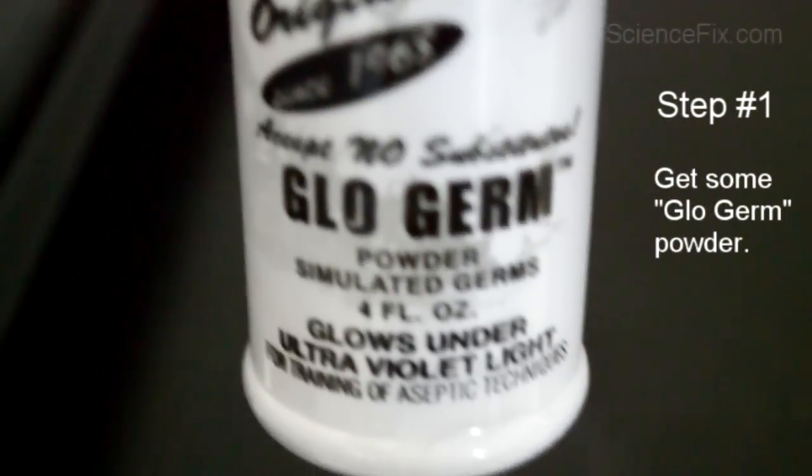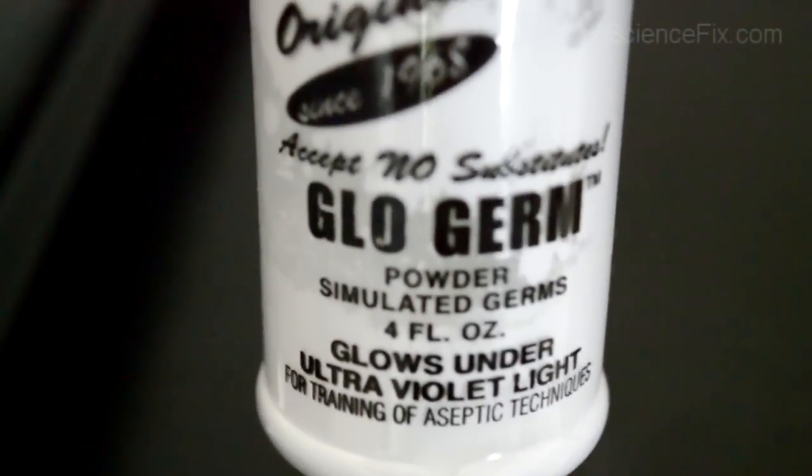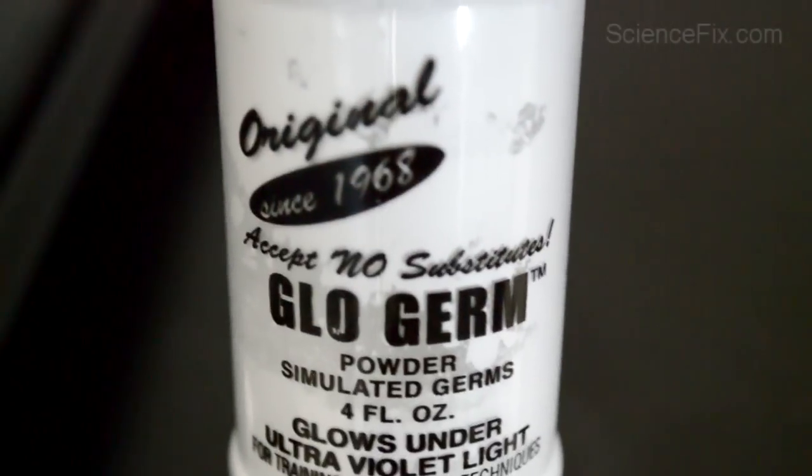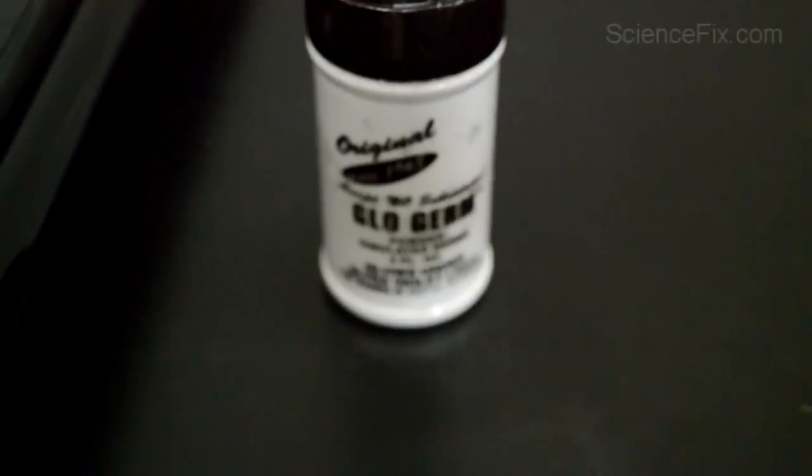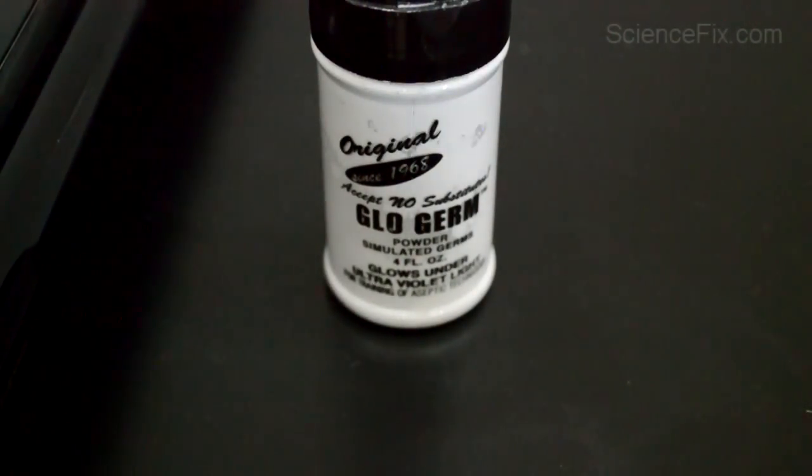This is a tool that's used to show how to use good hand-washing techniques to effectively get rid of all the dirt and germs that might be on your hands. As you can see, in the presence of a black light, the white powder will glow.